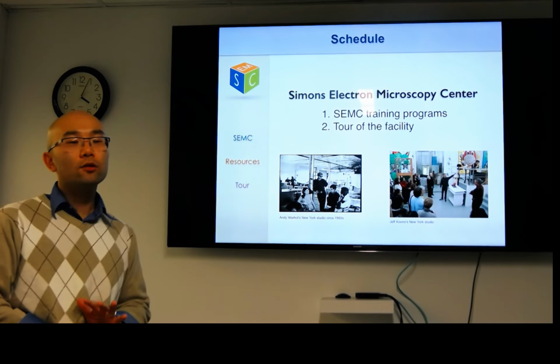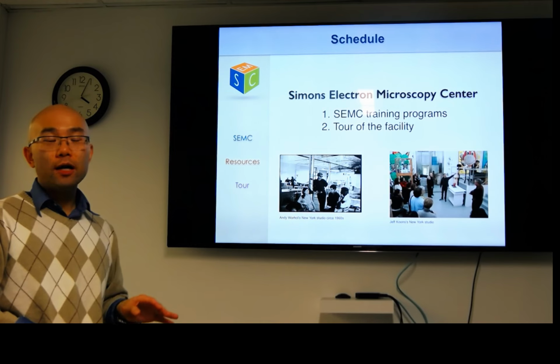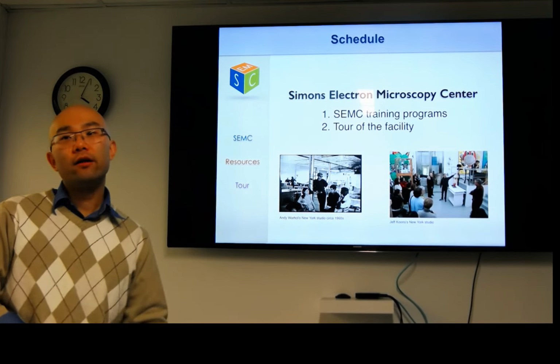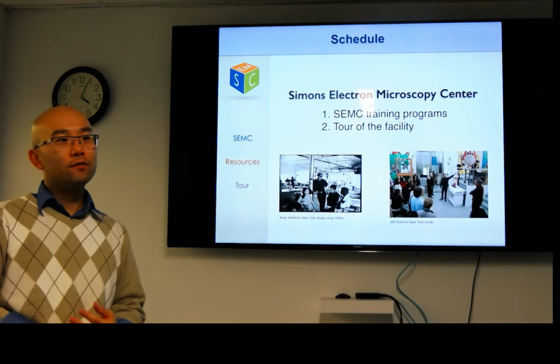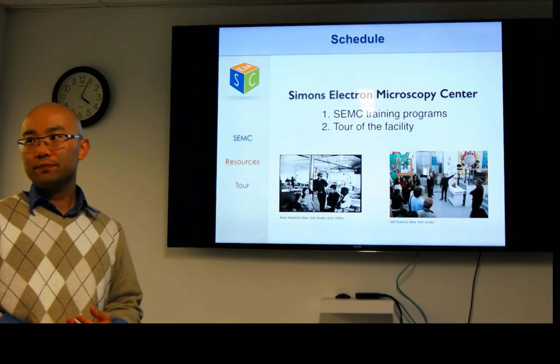Okay, so that's a little bit about the center, and then what we're going to do next is have a tour. I will caution you, we're going to go through certain areas with high field magnets, so if you have anything that you don't want to get demagnetized, you can leave it in this conference room.